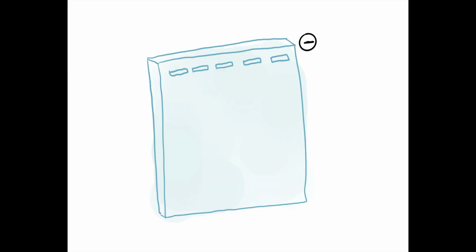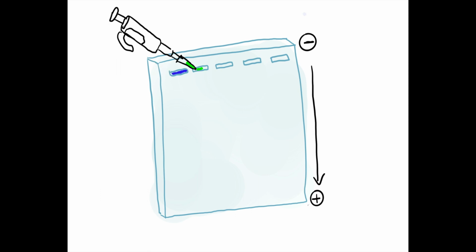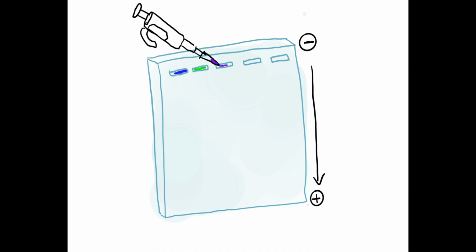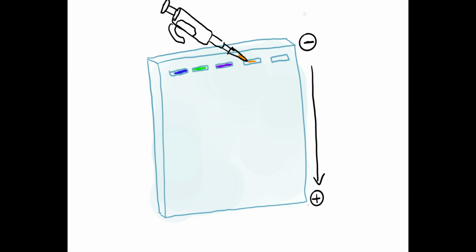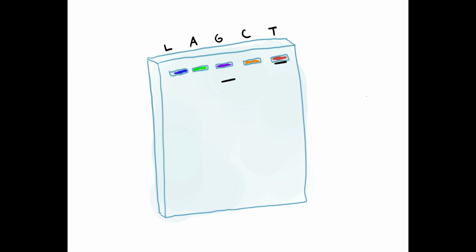So we're going to do gel electrophoresis to separate the DNA fragments based off size. And you run the gel from negative to positive, and DNA will naturally go towards the positive because it has the negative phosphate groups. First you're going to add the ladder. That's just fragments of known sizes that you can compare to. And then in the other wells, the first one, you're going to put the ddATP reaction solution. So in each of those wells, you'll just see that, oh, it ends in A, or this fragment ends in G, C, or T. And then you're going to start running your gel.